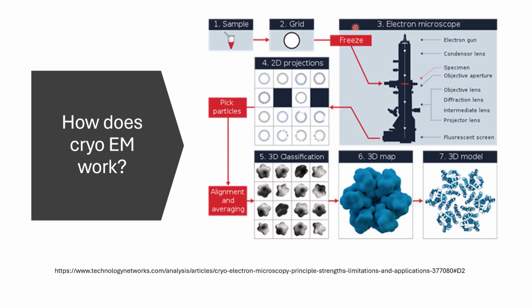The resulting 3D map provides a representation of electron scattering intensities of the sample, allowing scientists to gain insights into its structure. Atomic models are fitted into the density map and refined iteratively to represent the experimental data accurately. The refined models are validated and analyzed to understand the structural features of the studied molecules.